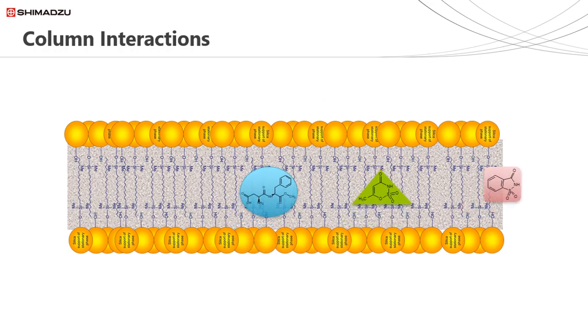When we stopped the flow at a certain point, we saw that the 3 analytes were in different positions down the column. The red analyte, having had the least amount of interactions with the stationary phase, is ahead of the others. The green analyte has more interaction with the stationary phase, but less than the blue analyte, which has had the most interaction with the stationary phase and thus brings up the last place among these compounds.